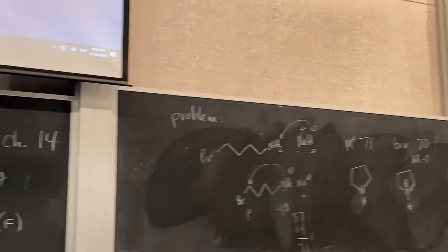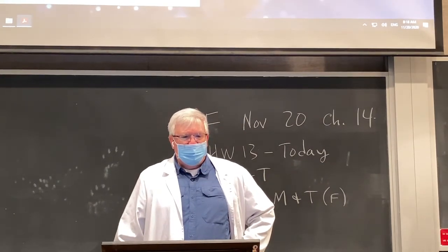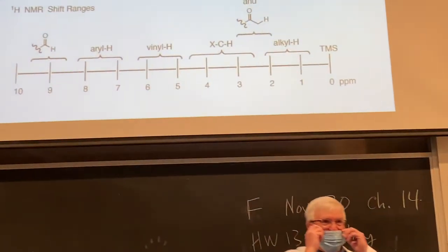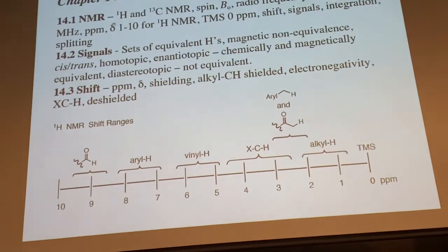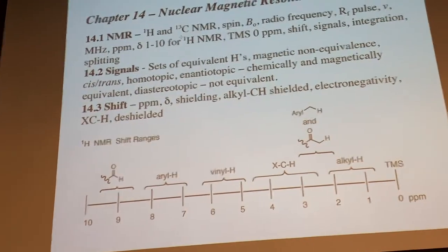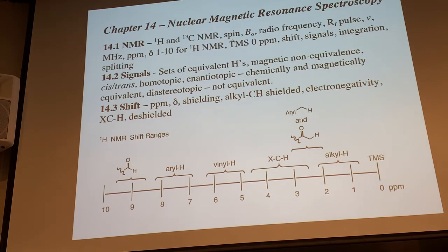We've got NMR now, and NMR's the rest of the story here. So how do we know we've got what we've got? I've pointed out some ambiguities if we're just relying on mass spec and IR. But NMR here, and we can look nuclear magnetic resonance of both protons in a molecule and C13s. They're actually separate experiments. And this works because they have a nuclear spin of 1/2, which actually can resonate in a magnetic field. So we're talking about nuclear spins here.